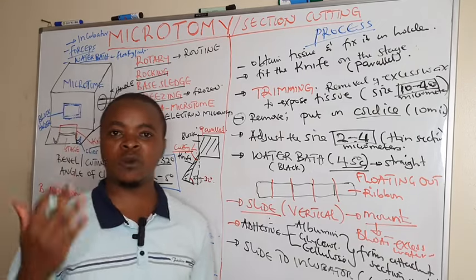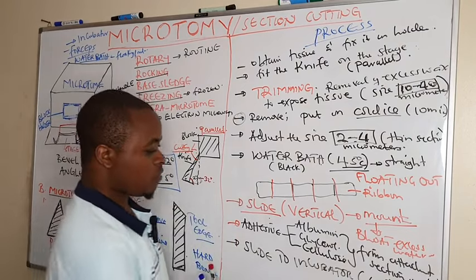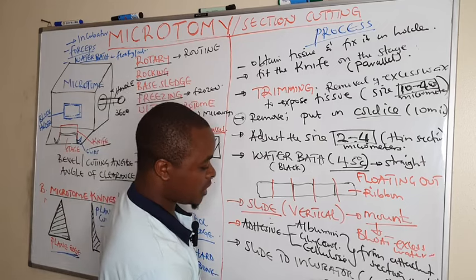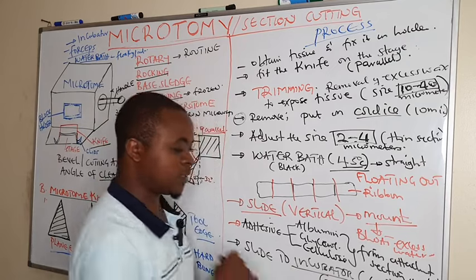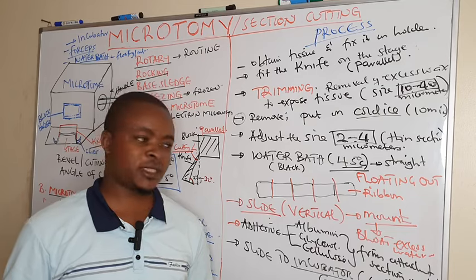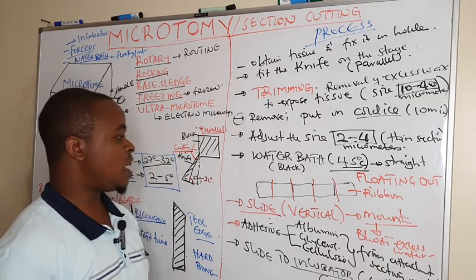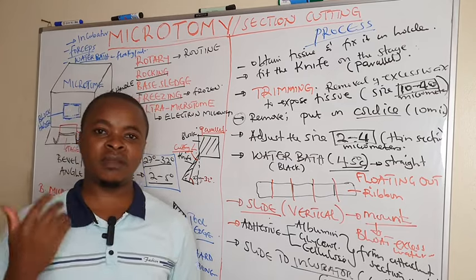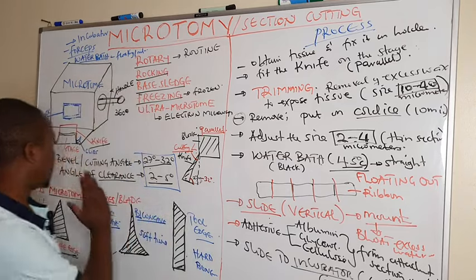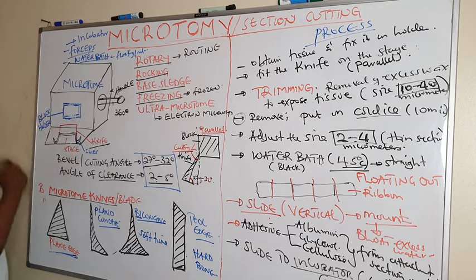We heat in the incubator at 60 degrees for 30 to 60 minutes to melt the wax so that the tissue remains without any wax. This heating enables melting of the wax which was added during embedding. Every time you want to trim different embedded tissues, you have to clean the stage to prevent cross-contamination.